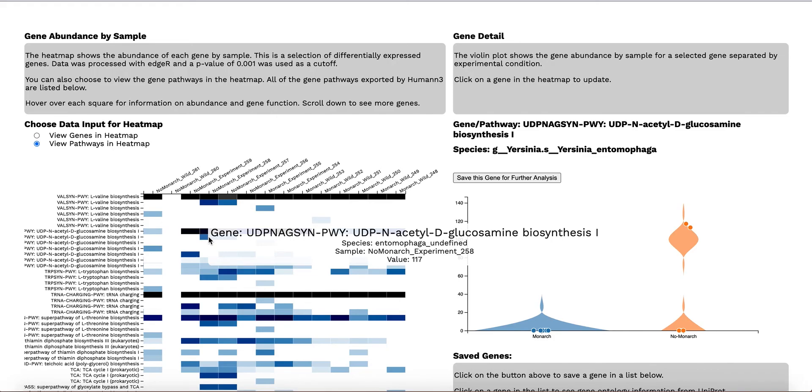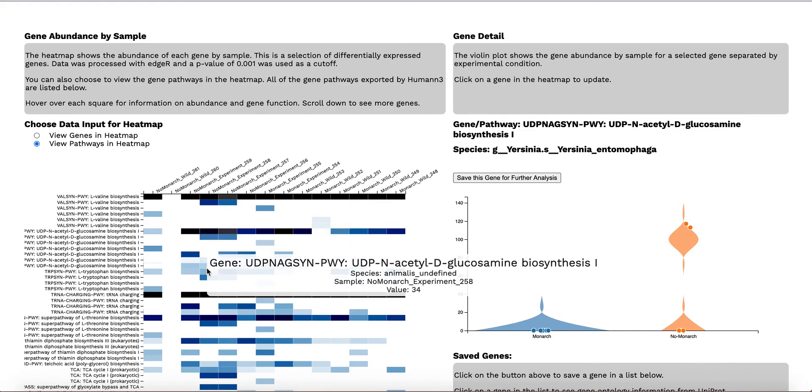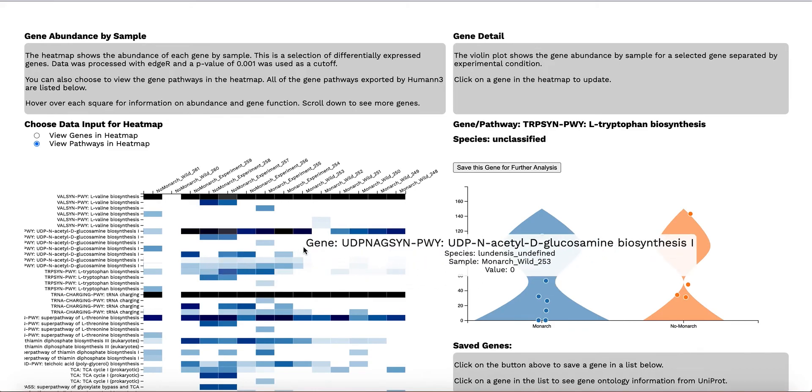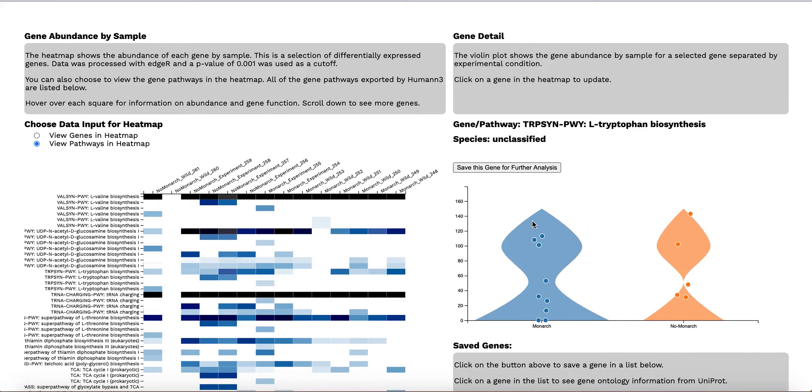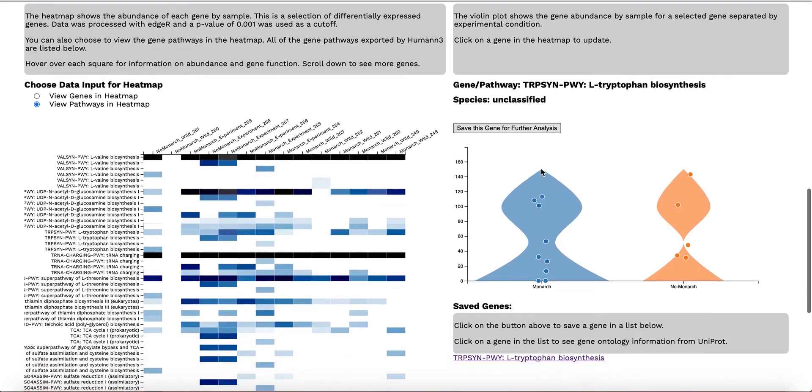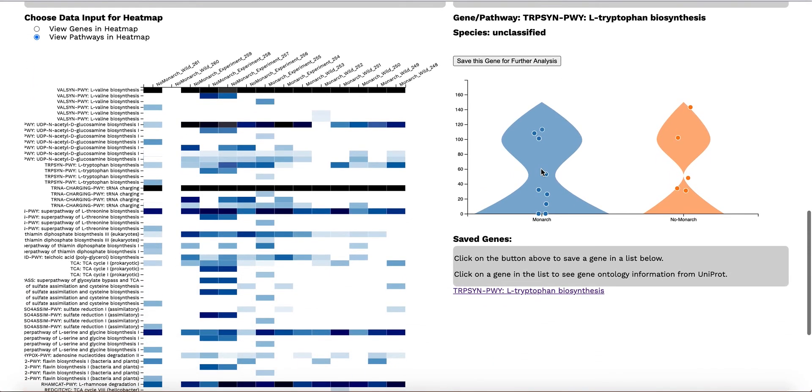If you are interested in more information about a gene, you can click on it and it will update the violin plot. You can see the differential expression between the two groups of interest and more detail on mouseover. Clicking on the save button creates a link that will take the user to an online reference database containing more information about the selected gene.